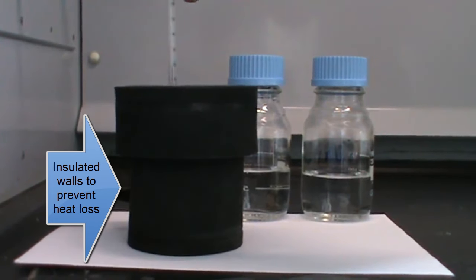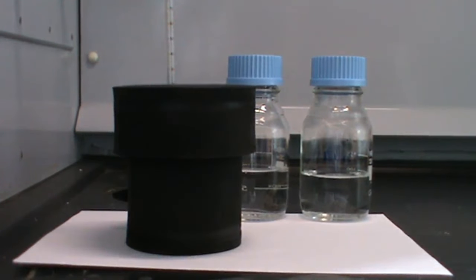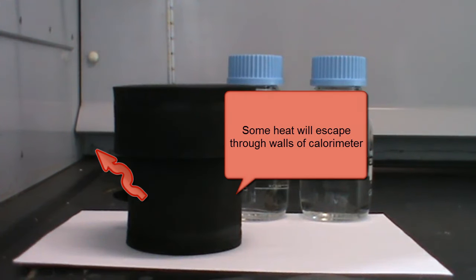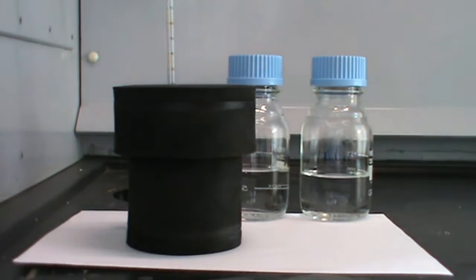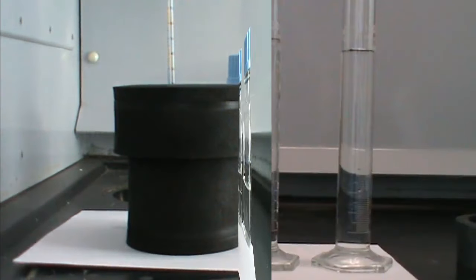We'll measure the increase in temperature in the reaction using a thermometer placed in the calorimeter. The problem is though that even though the calorimeter is insulated, some heat will still escape through the walls of the calorimeter. It's not perfect. So we need to first calibrate the calorimeter to see how much heat will be lost through the calorimeter.